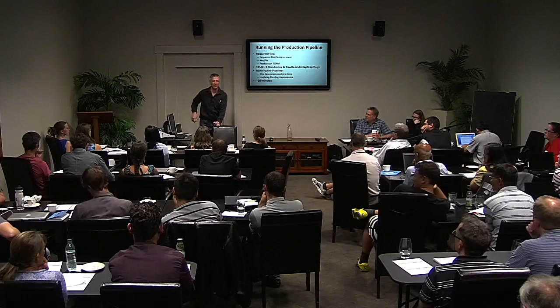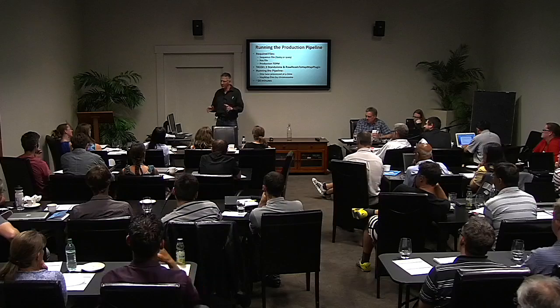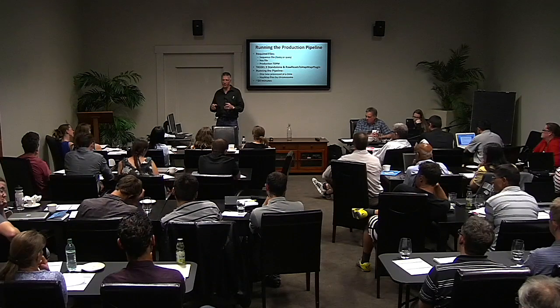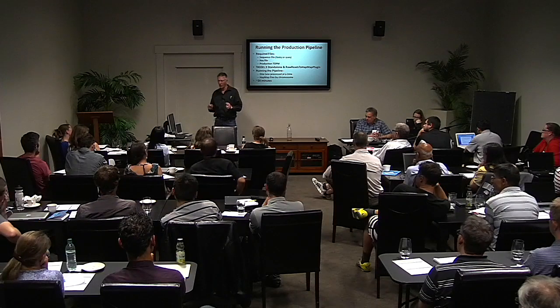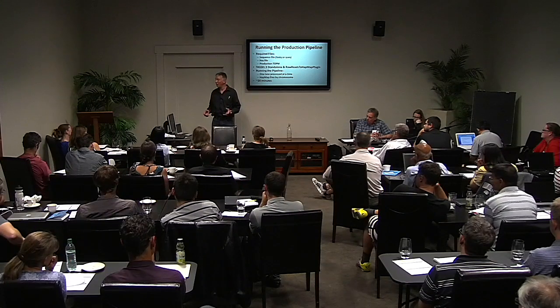Well, there's another one of those "it depends" answers, right? Let's just take a simple example. None of this stuff is trivial, but let's say you've worked out a discovery build that you think has been pretty good. You've got good quality SNPs, and you're using it for quite a while. But then you go out and you get some new germplasm that is substantially different than what went into that discovery build. You would probably want to do another one, right, and incorporate all that data into that new build. So that would be one way of determining when you would want to do that.